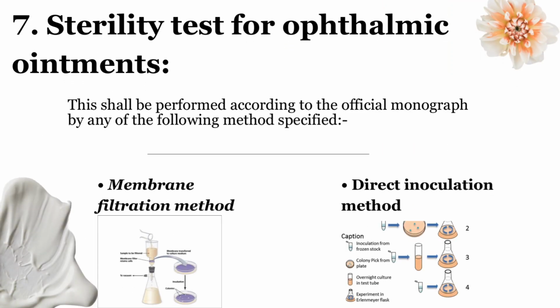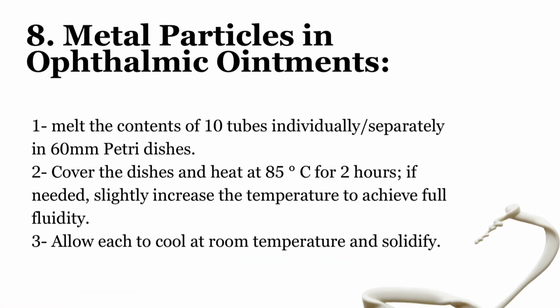7. Sterility test for ophthalmic ointment. This shall be performed according to the official monograph by any of the following methods specified: membrane filtration method, direct inoculation method. 8. Metal particles in ophthalmic ointment.